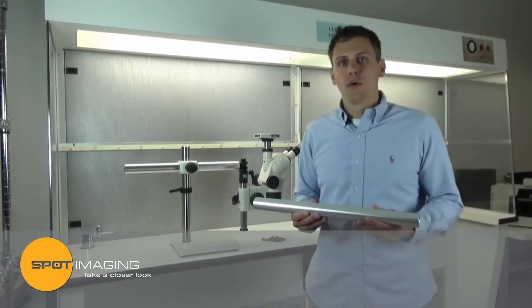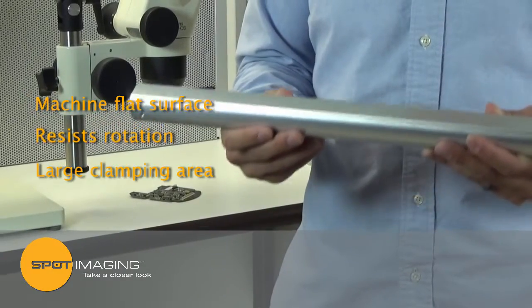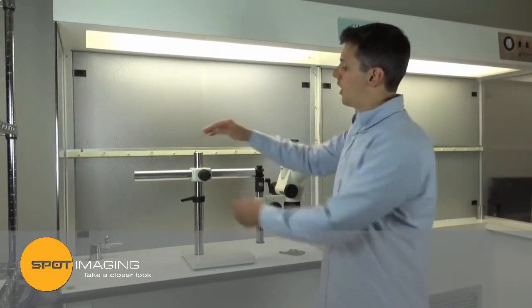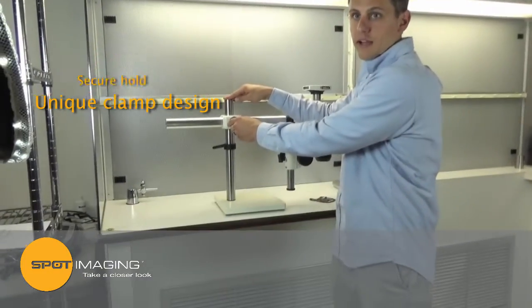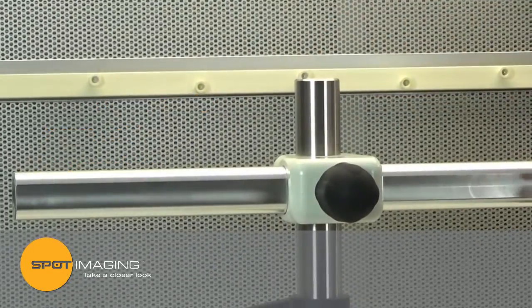Our horizontal pole has a machined flat surface to resist rotation and provide a large clamping area. Our unique clamp design provides a secure hold without scratching or marring to ensure a lifetime of use.